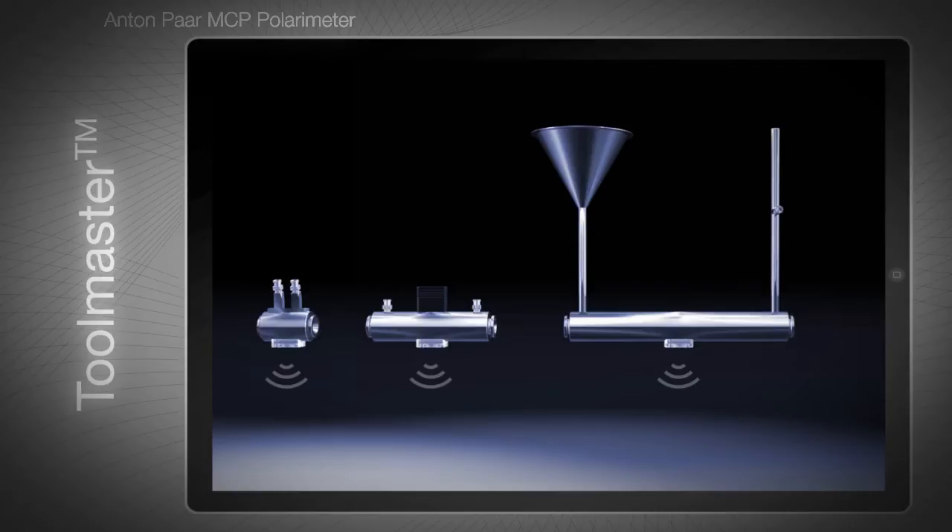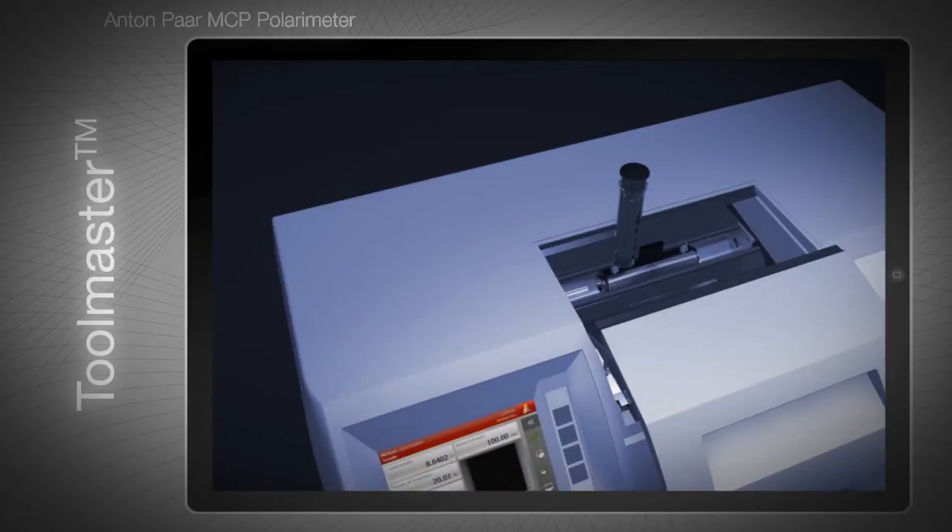Each sample cell has a built-in RFID chip. Information stored on the chip includes the serial number, length, and material of the sample cell. When you insert a sample cell into the MCP, this information is immediately transferred from the chip to the polarimeter wirelessly. The data is transferred within seconds, so you save time because no cables have to be connected.